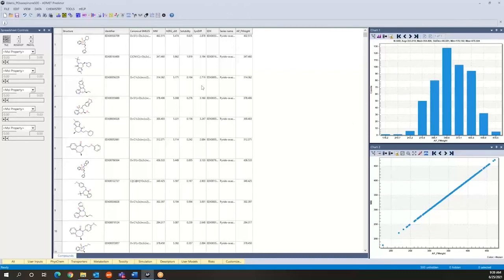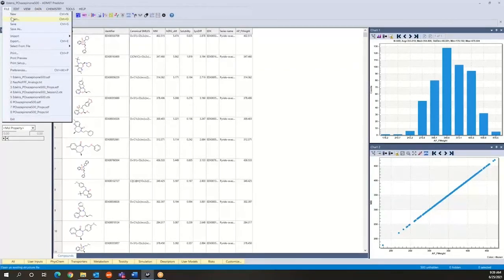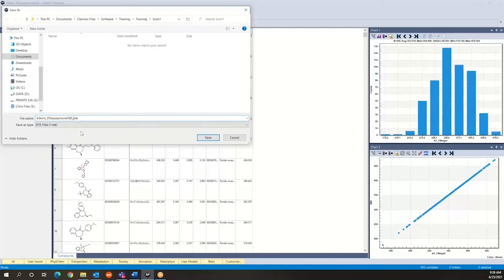So at this point I would like to introduce you to this ability to save your work as an .xtk file and these are session files. It's a proprietary format to AdMet Predictor but it's very useful as far as again setting up certain checkpoints in your work. So for example here we can do save this and we're going to save this as an .xtk file so we can call it maybe session1.xtk.